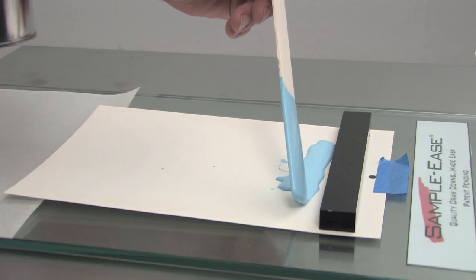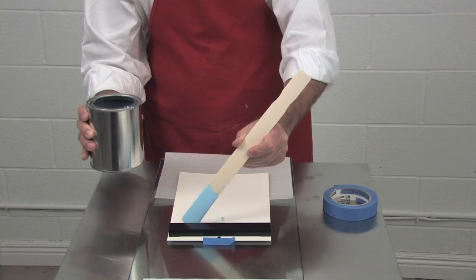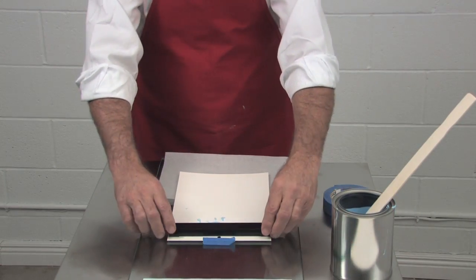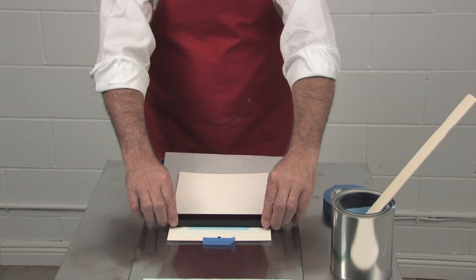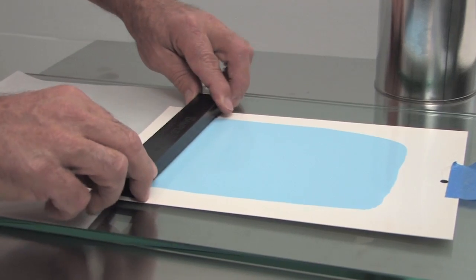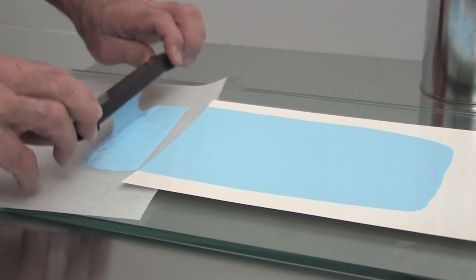With two hands, pull the drawdown towards you. Don't put a lot of pressure down — just a nice smooth pull off the end of the card.